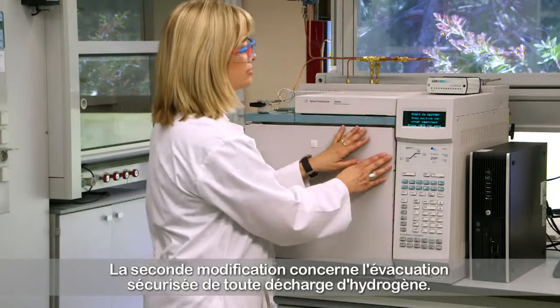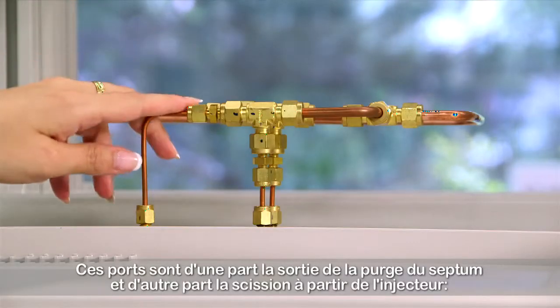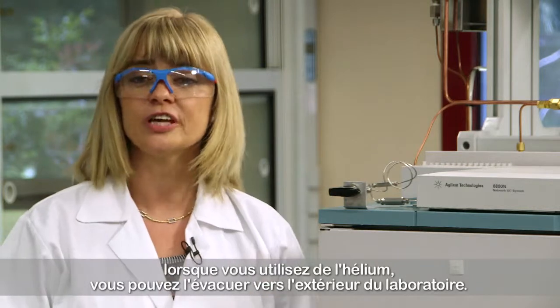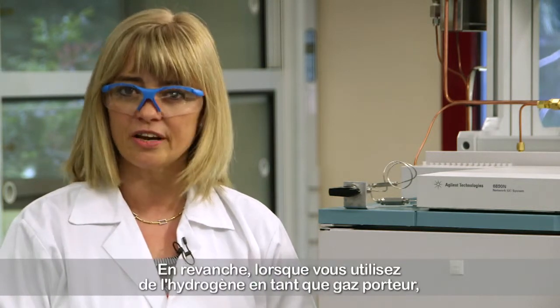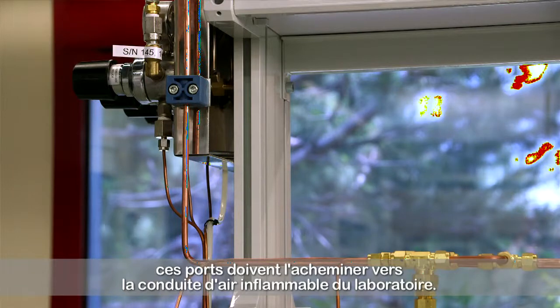The second modification is related to safely venting any hydrogen outlet stream. These ports are the outlet of the septum purge and the split from the injector. When helium is used, it can be vented outside the lab. But if hydrogen is used as a carrier gas, these ports need to be connected to the lab's flammable vent line.